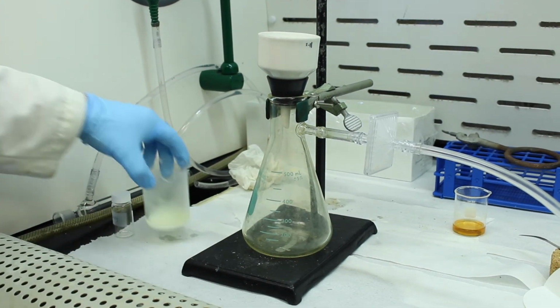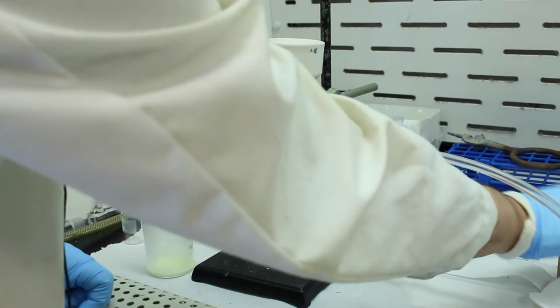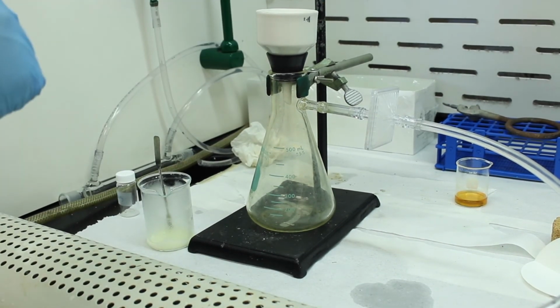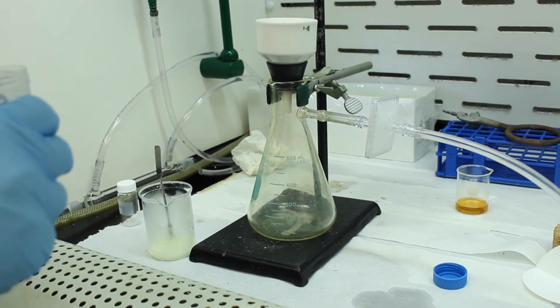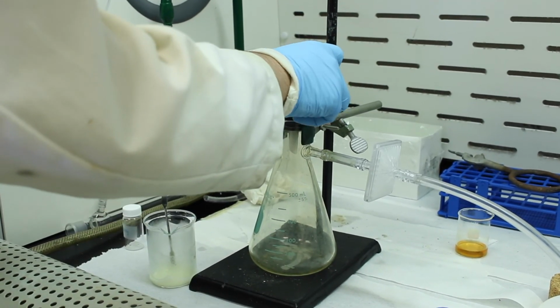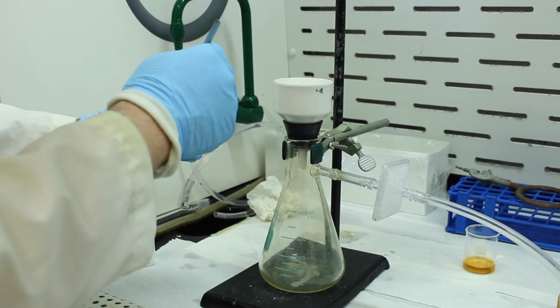Okay, so we have our mixture here, which has been chilling in an ice bath, so nice solid. So I'll take a spatula. Here it is. We'll sort of agitate it, and then we're going to filter it on this filter here. So in fact, first, why don't we wet the filter with some hexane. So I have some cold hexane here that we'll use. So now we can take our solid and filter it.